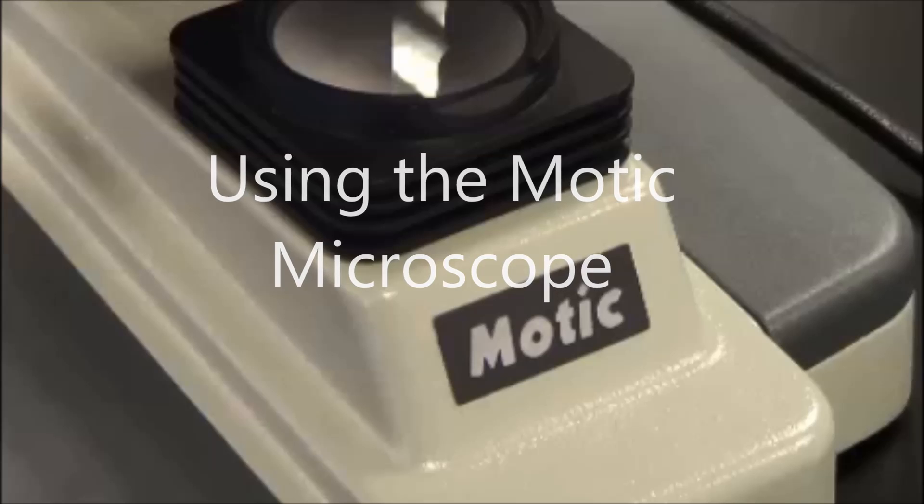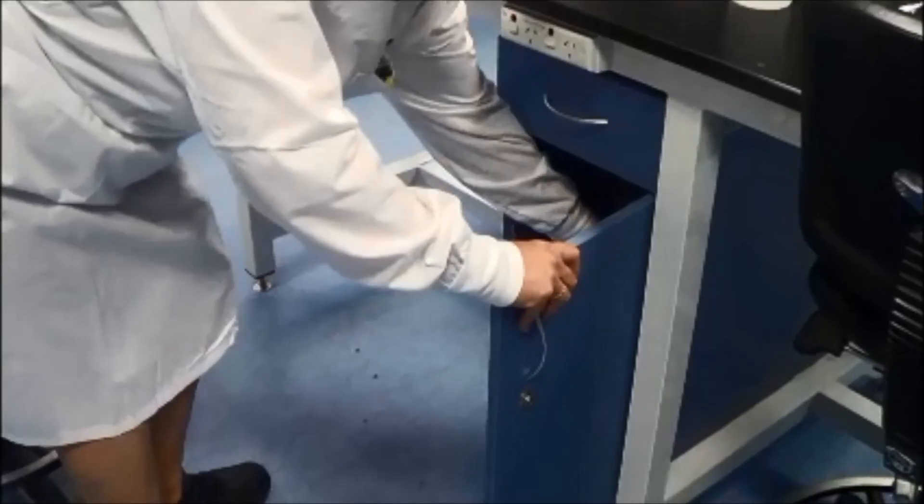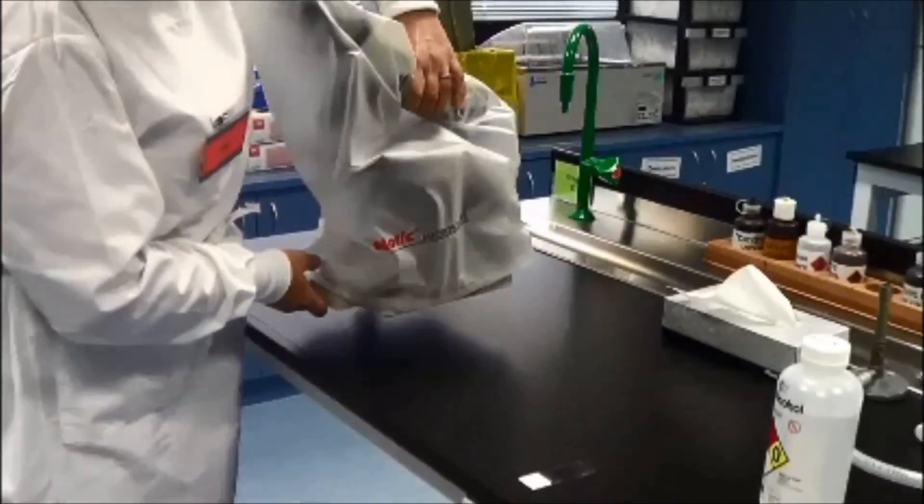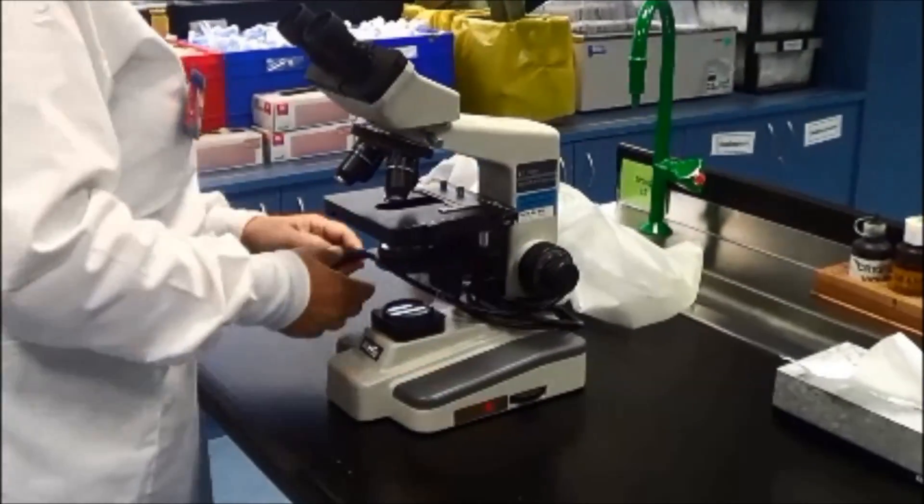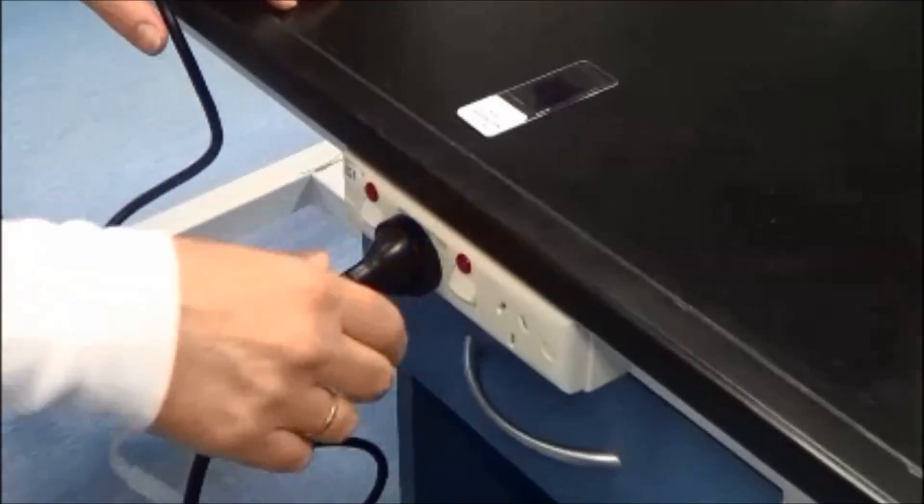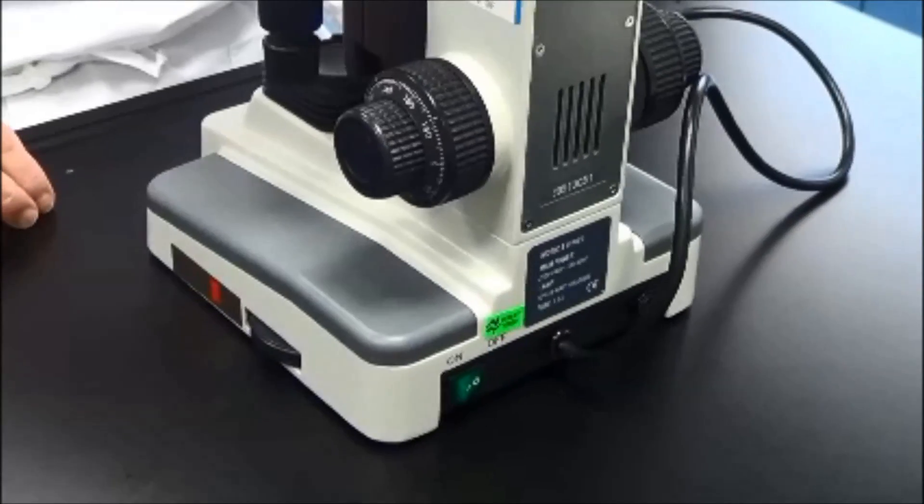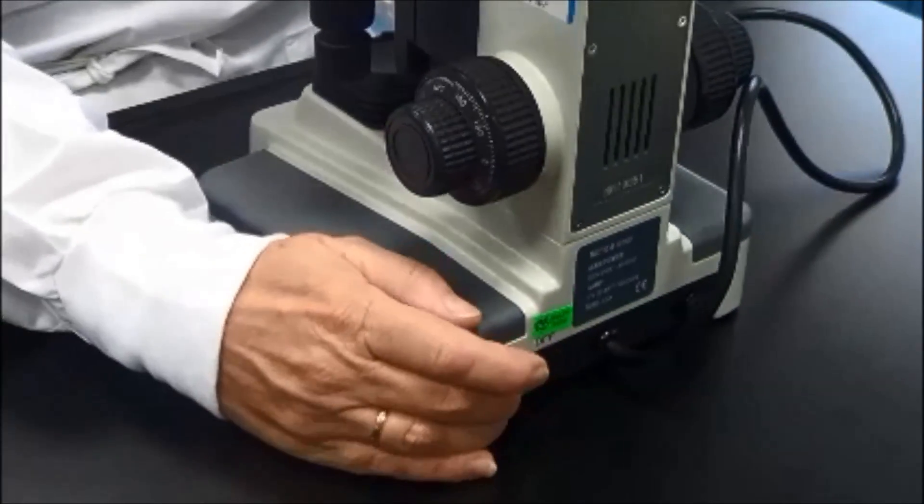Using the Motic Microscope. Carefully remove the microscope from the cupboard and place gently on the bench with the eyepieces pointed towards you. Remove the dust cover. Turn the microscope on and adjust the brightness to between 3 and 4 using the voltage control.